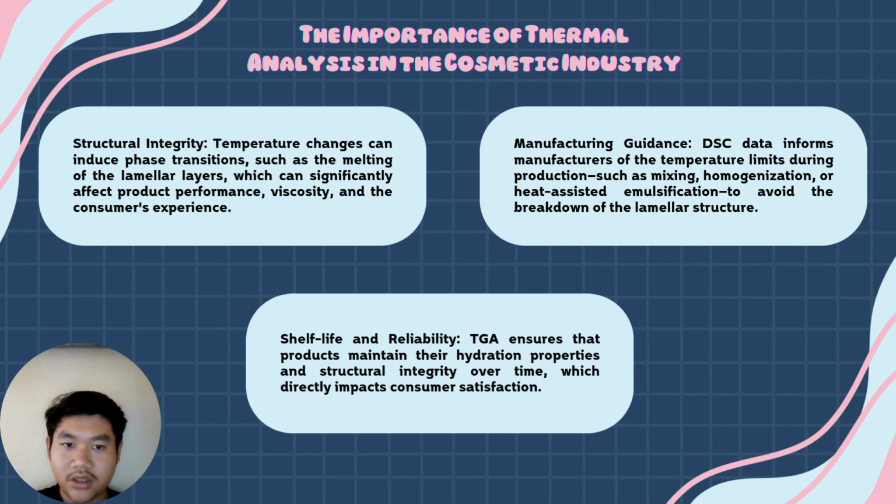For the manufacturing guidance, DSC data inform manufacturers of the temperature limit during production, such as mixing, homogenization, or heat-assisted emulsification to avoid the breakdown of the lamellar structure. For the shelf life and reliability, TGA ensures that products maintain the hydration properties and the structural integrity over time, which directly impacts consumer satisfaction.